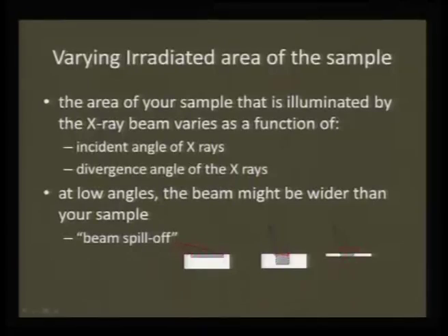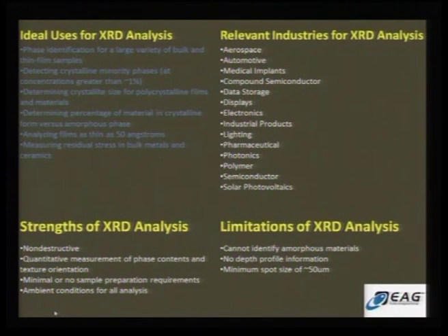So, these things we need to bear in mind, and I just want to mention to you some of the relevance of this XRD analysis. As I am progressively mentioning in this lecture, there are different ways of using X-rays for characterizing your sample. The strength of XRD is that it is non-destructive, quantitative measurements can be made, and texture can be used.